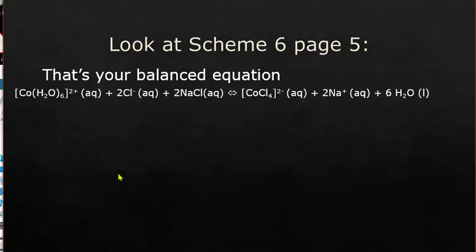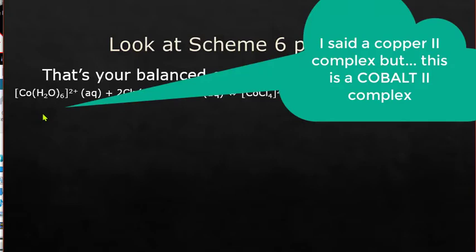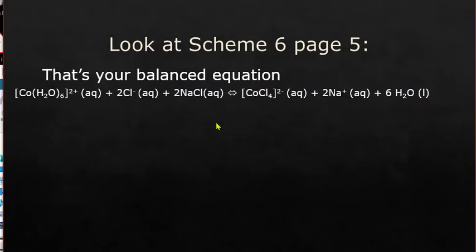It looks like this, where you take, again, this is a complex. It's not meaning molarity now. It's signaling you that you have a cobalt-2 complex. Interesting is that it's complexed with water. It reacts with chloride ions. Now, this might help you understand a little bit, just charge balance. That cobalt hexaaqua complex has a +2 charge, so there has to be charge around to counterbalance it, and so it comes in the form of chloride ions. So anytime you add cobalt-2 chloride to water, it makes this complex, and then the chloride ions are also floating free so that the charge is balanced.